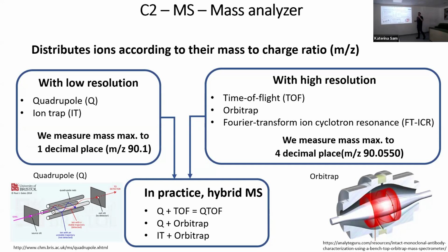It's very important if I have non-target metabolomics and I need to establish the elemental composition. I need the high-resolution machine. Typically, low resolution mass spectrometry is used for quantitative analysis.